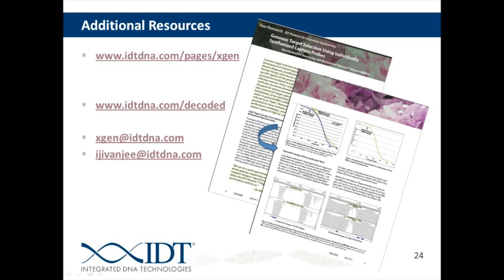Okay. But as far as looking into variants, NCBI and Ensemble are both pretty much about as good as we have right now. Particularly when you get outside of humans, there's not a lot of annotation and it's fairly sparse. The genome browser is a little bit behind, and the big problem with the genome browser is that they don't annotate well how often they're updating the databases that they're using.